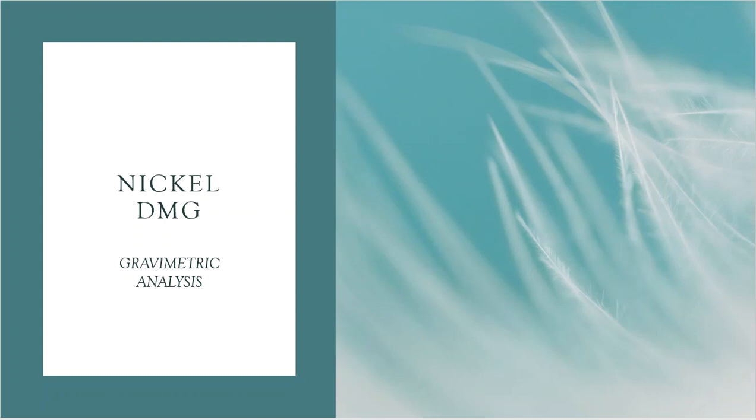We are on to another laboratory experiment together, and in this experiment we're going to focus on something called nickel DMG. Alright, well, nickel DMG is not the most important part of this lab experiment, no way, no how. What is important though with this lab experiment is this thing called gravimetric analysis. So, what is gravimetric analysis?